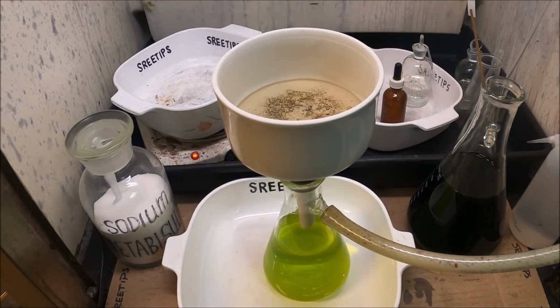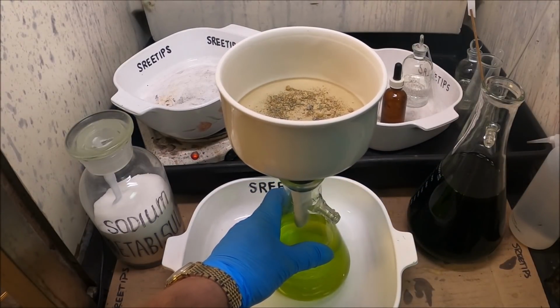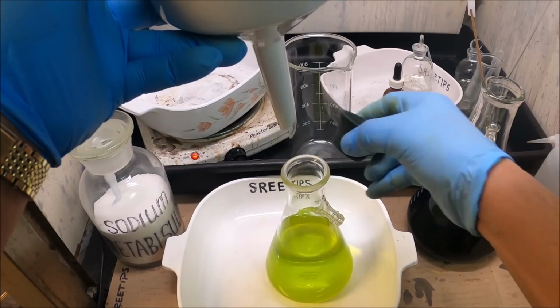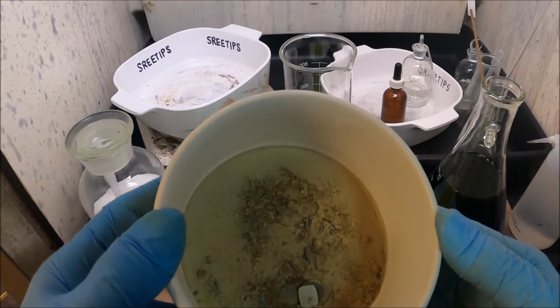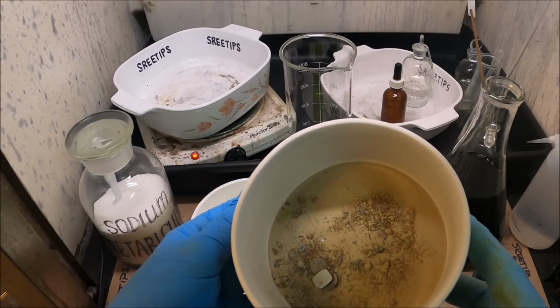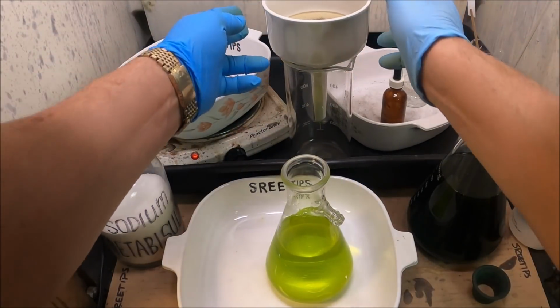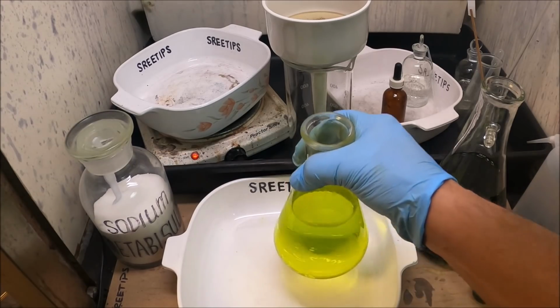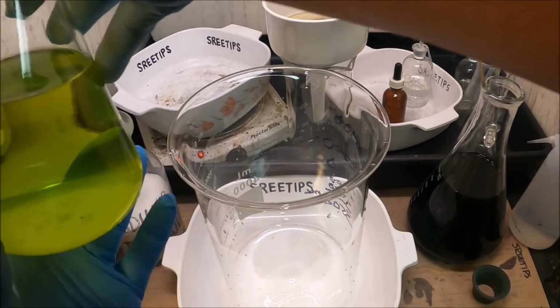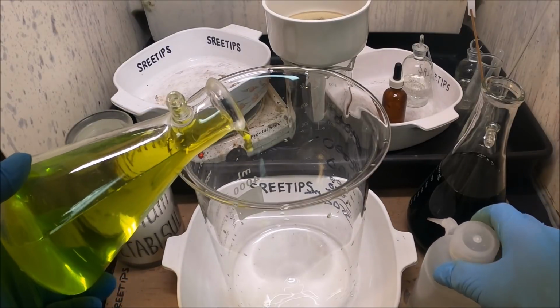Here we go. I've got everything all set up so that hopefully I can do this whole thing in one take. Here is our material in the funnel. Just mostly looks like non-gold material. I'll add this to my paper storage. Now what we'll do is, I've got a big beaker. I'm gonna do this reaction in a big beaker here. Should have about 1.5 liters of solution with gold in it.